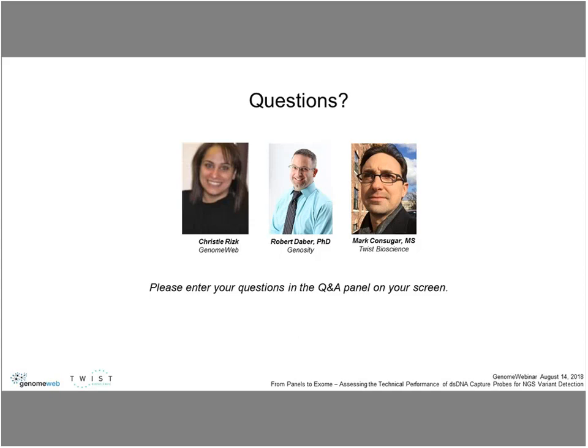And then in terms of the uniformity, yes, we did. We looked at uniformity across each of these technologies that we investigated. We did the most work in comparing what we considered our final library prep conditions with IDT capture versus Twist, because we started doing this Twist work kind of at the tail end of our R&D, so we didn't go back and do extensive comparisons with some of the other methods that we displayed in the tables here.